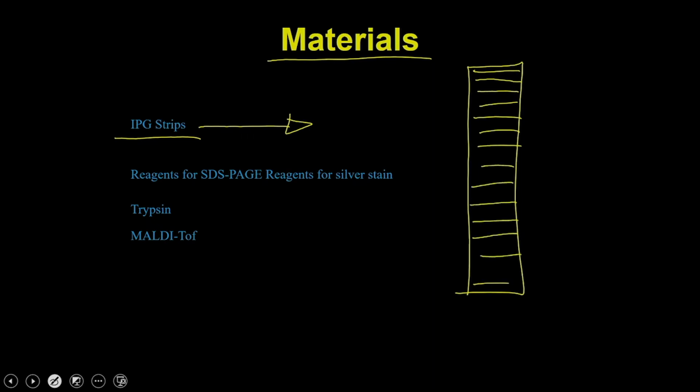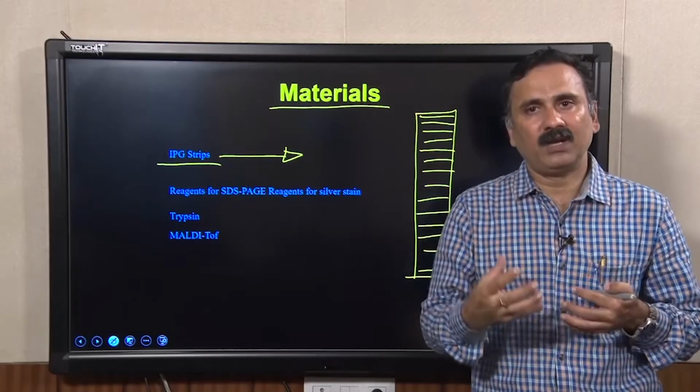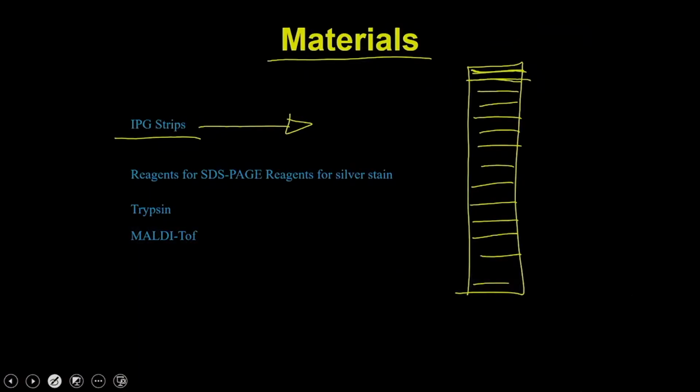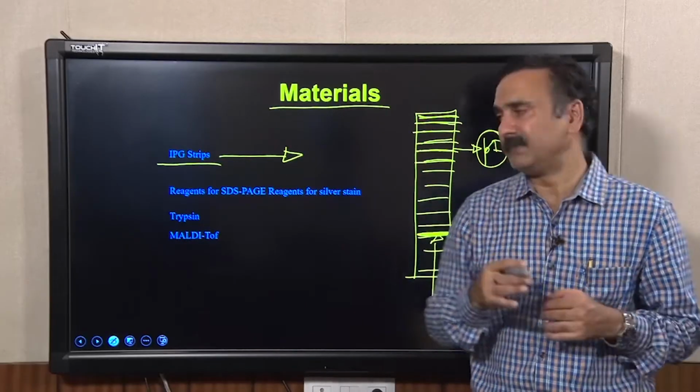Ampholytes are amphoteric molecules, and these strips are coated with these molecules. So, each region corresponds to a particular pI. Because of that, when the proteins run and reach their isoelectric point, they get immobilized at that particular region, and so they get separated based on their isoelectric point.